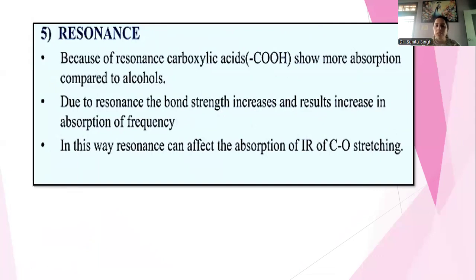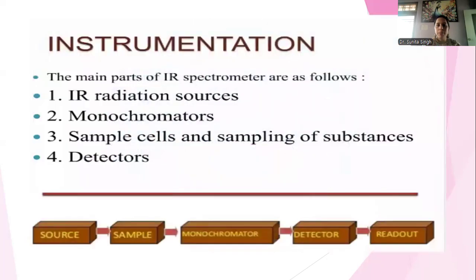Resonance also plays an important role. Carboxylic acids show more absorption compared to alcohols. Due to resonance, bond strength increases, which results in an increase in the absorption frequency. In the same way, it can affect the absorption of CO stretching. So resonance also plays an important role when it comes to the magnitude of the vibrational frequency.